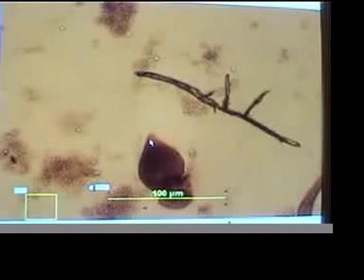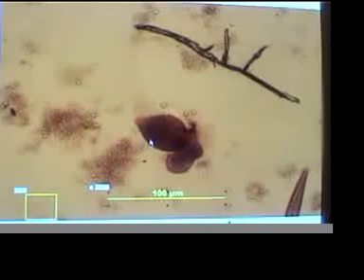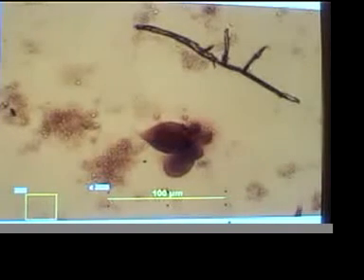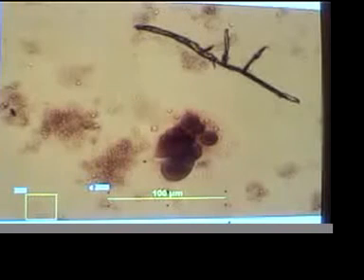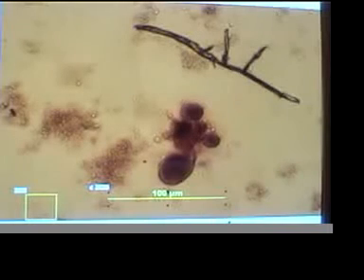Here we have a dramatic shape change right there, right before our eyes. See that? It's another one of those changes where it turns into a series of spheres and gets completely reorganized.